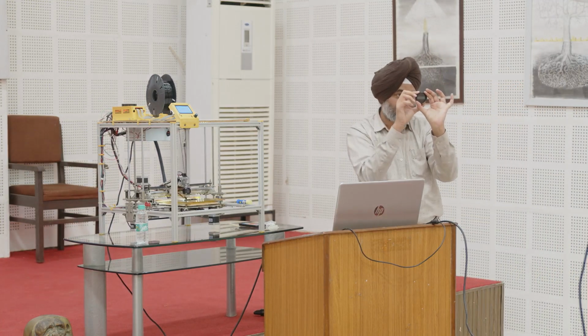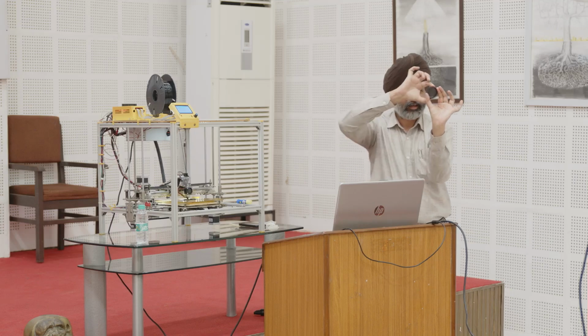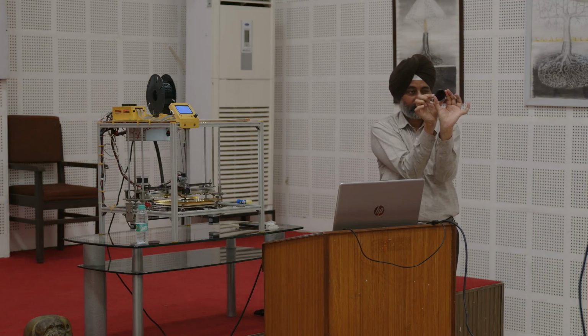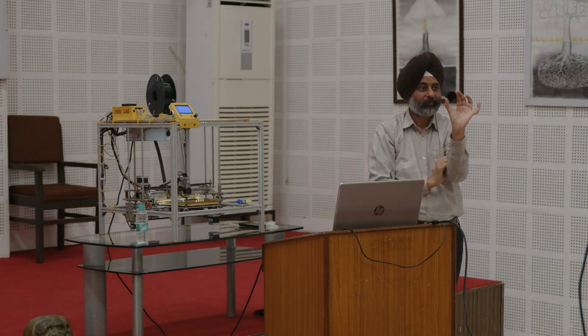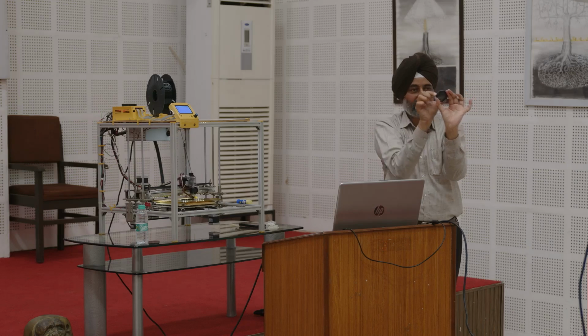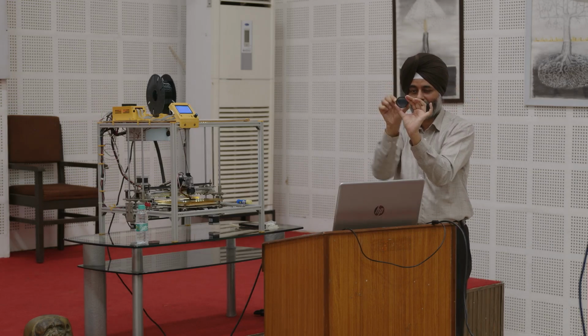Can you see my eye? You can see me. Now let's turn it by 90 degrees. I'm gone. Turn it by another 90 degrees. Visible again. Right?